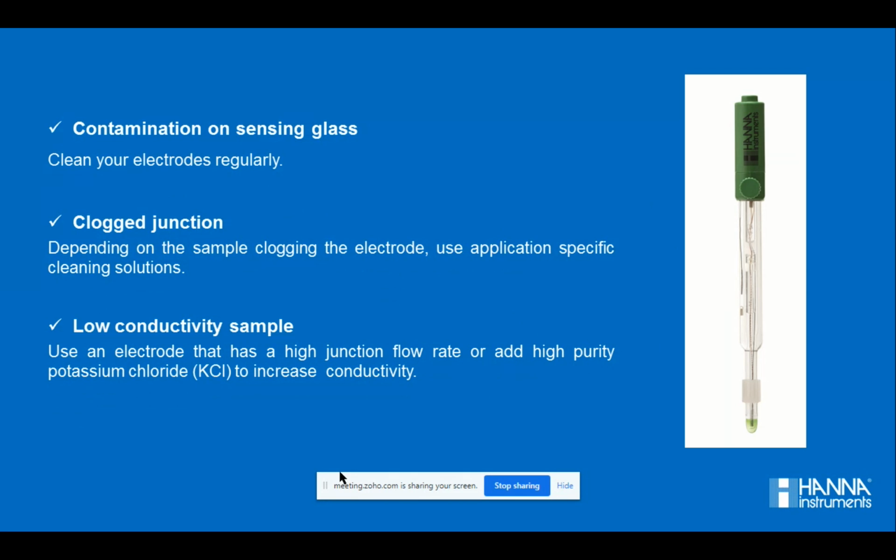Thus, the solution or the troubleshoot to this common issue is to clean your electrode regularly with cleaning solution.